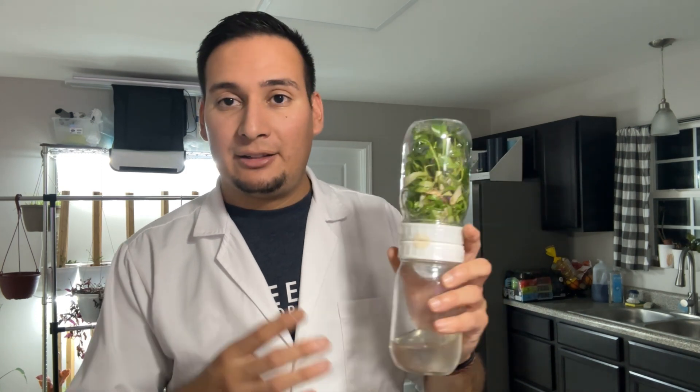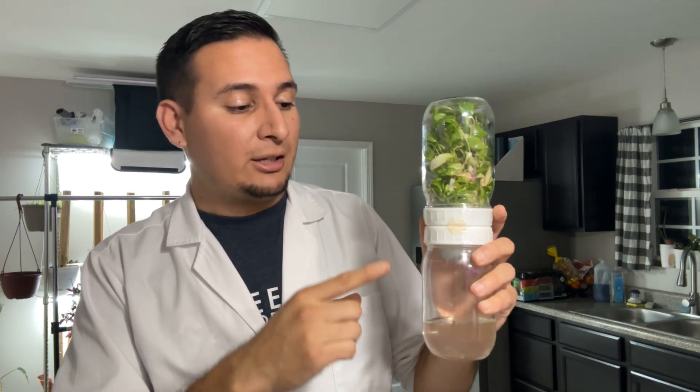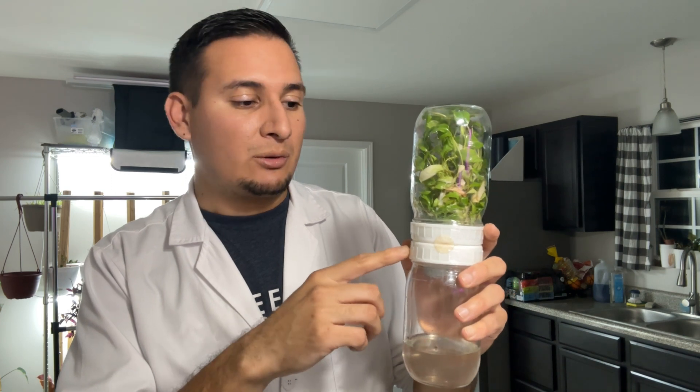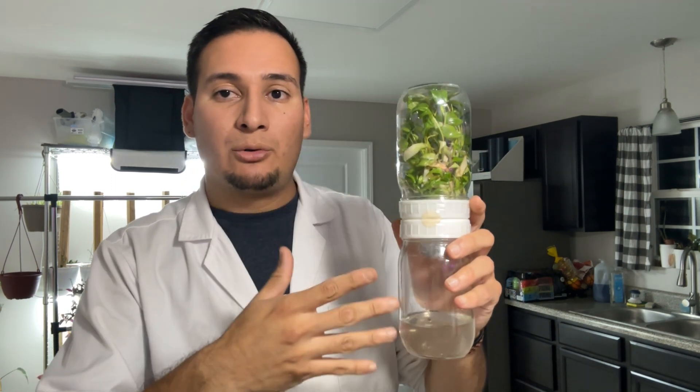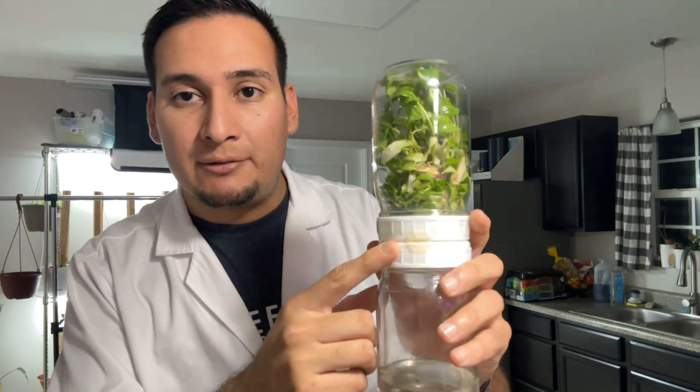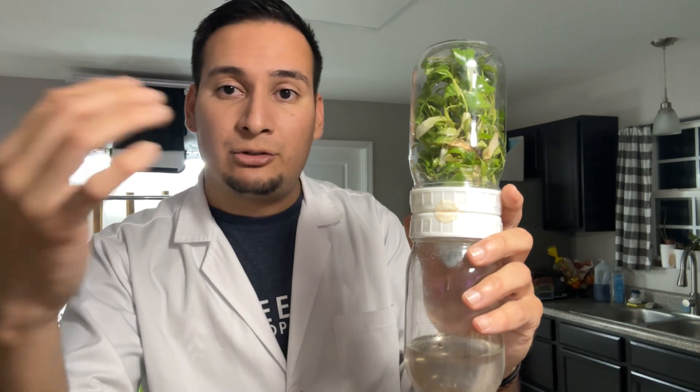I want to be taking plants out of the biocoupler. This is a biocoupler — if you are not familiar, this is essentially a temporary immersion bioreactor. This is a very simple version of a temporary immersion bioreactor where we have two jars and a coupler that allows the liquid media to move freely between both flasks, and a filter that filters the air to make sure there are no contaminants.